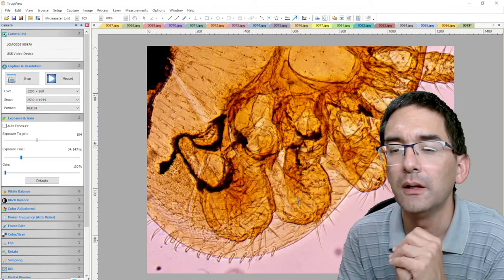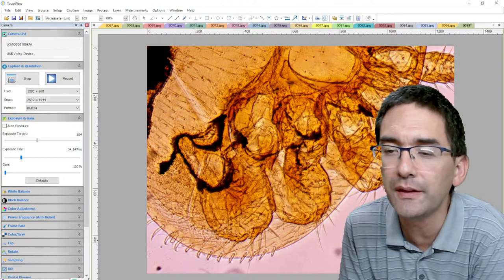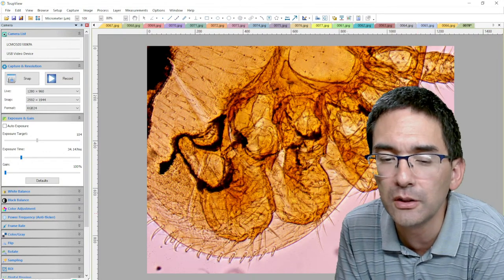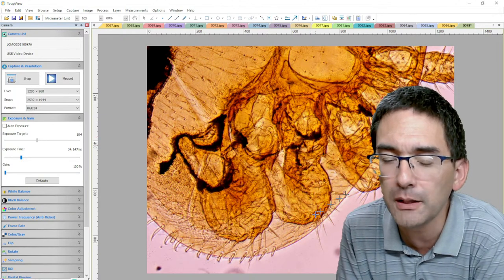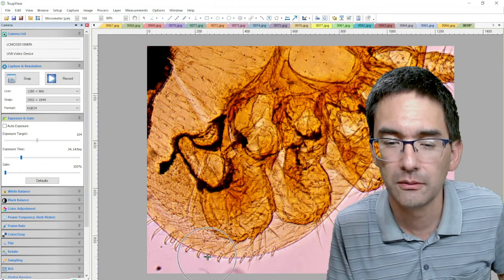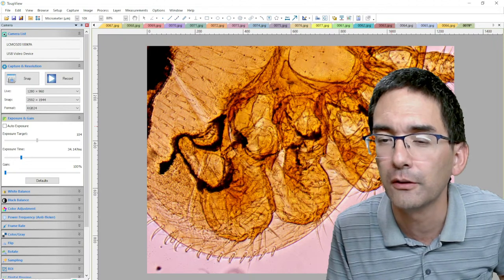Yep. Okay. Now you see, I think that's what I wanted to demonstrate to you. Now you see that everything is in focus. Okay. You have to fine tune the parameters a little bit. Otherwise you start introducing artifacts, but this is now a picture which contains all parts in focus. The bristles over here, and also the part over here, were blurry before.